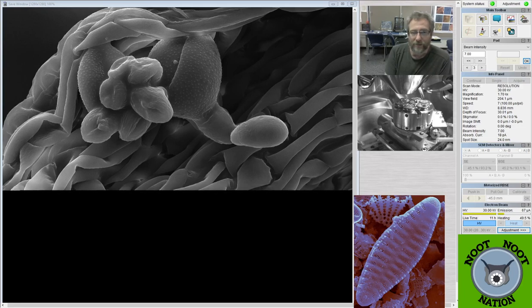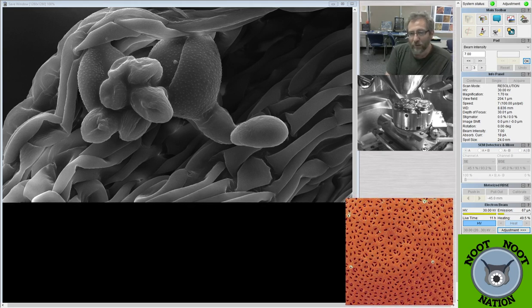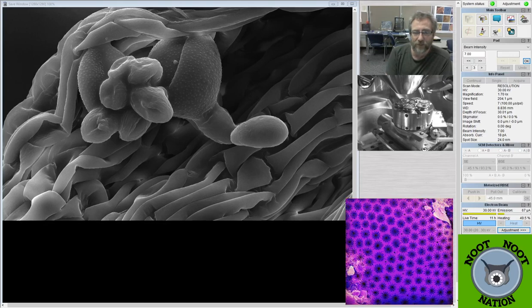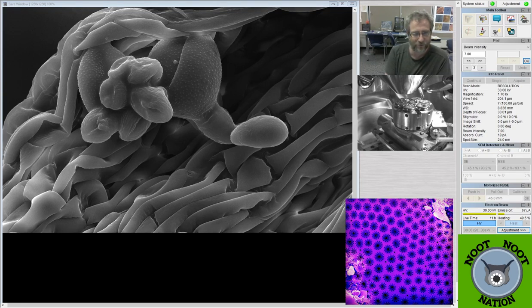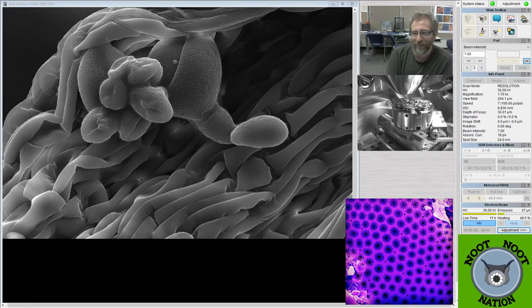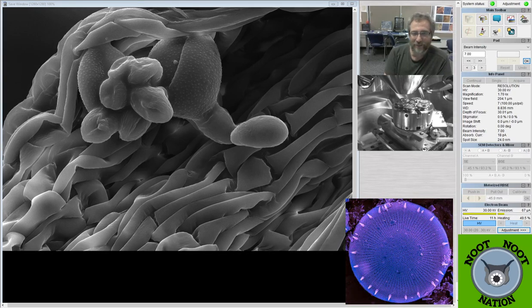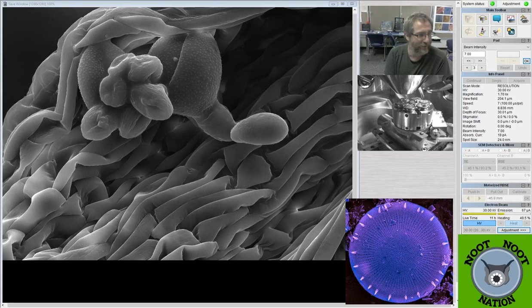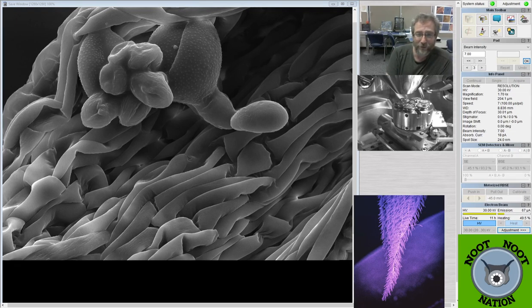But for most things, I probably have to coat them in gold in order to get a good image from them, and so that usually kills stuff. And then putting them in a vacuum, even a low vacuum, usually kills things. So I could put a grasshopper in there maybe, and my guess is it probably wouldn't live. Yeah, pretty violent. I probably would want to sacrifice it before I started. First, I'm going to coat you in gold, and then I'm going to stick you in a vacuum. It does sound, however, strikingly like the plot of two different James Bond movies.